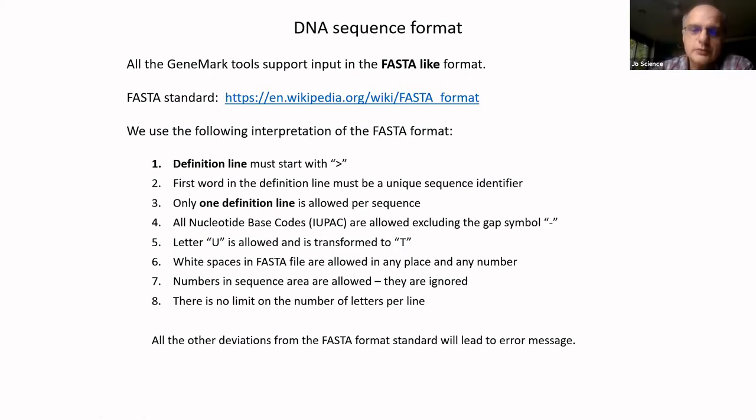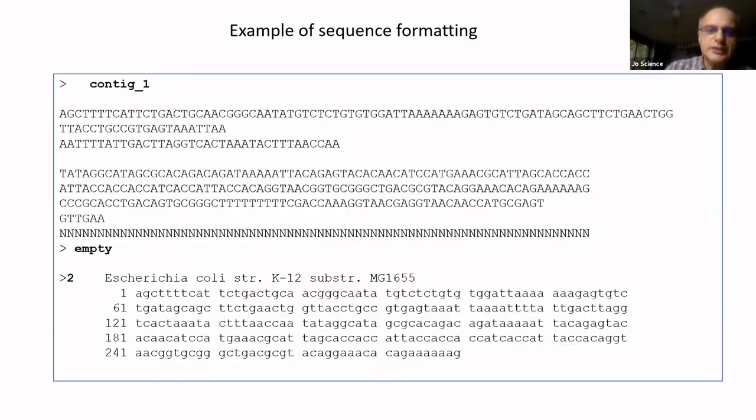So we also have some limits, and we also have some simplifications which imply fewer errors in what the user can do, because sometimes a user can put in a white space which is invisible on the screen, and it will stop a program because white spaces are not allowed in FASTA format. So we allow this type of minor changes.